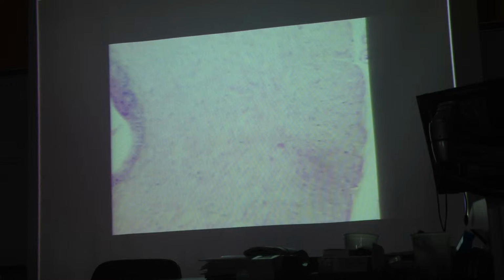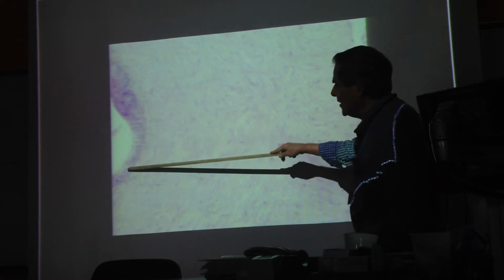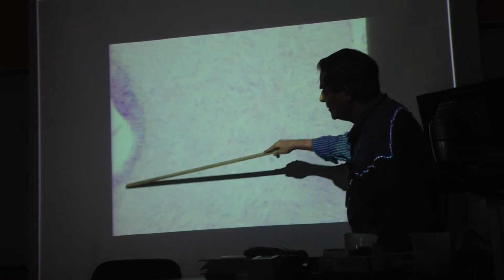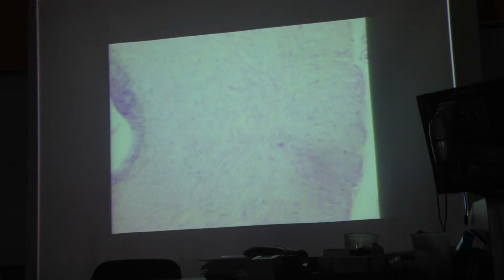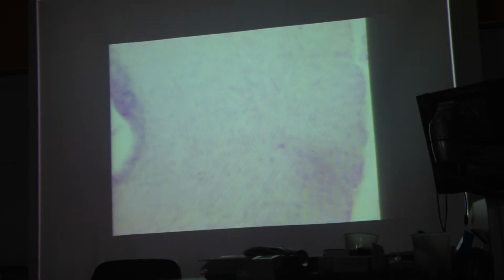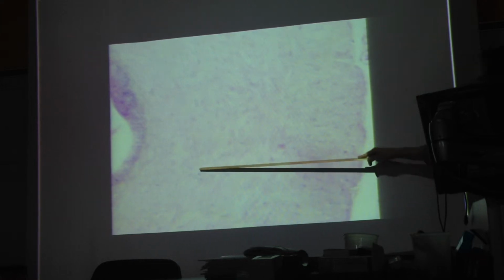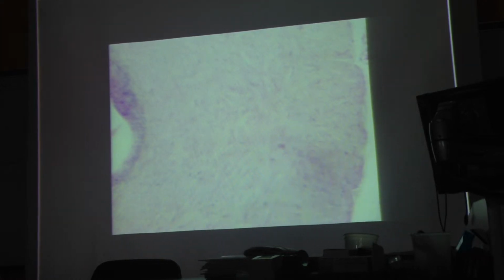See them here. Okay. There's your epithelium again, pseudostratified columnar. There's the lamina propria, thin layer, and here are your three muscle layers. This is longitudinal, this is circular, and longitudinal again. You can actually see it better under the microscope. Okay, so same arrangement. And again, it's the contraction of those muscle layers that move the sperm.